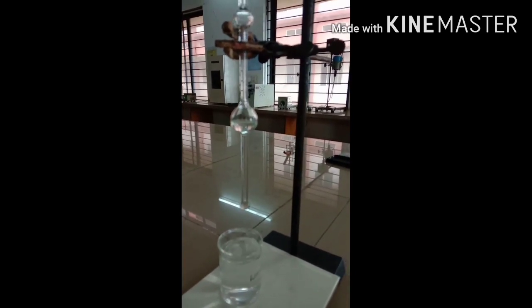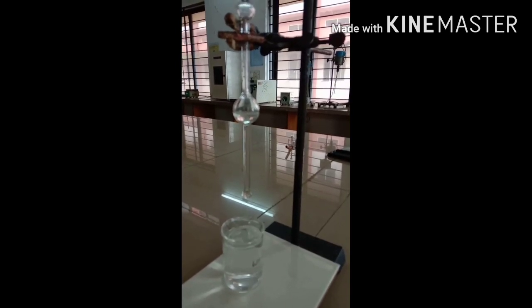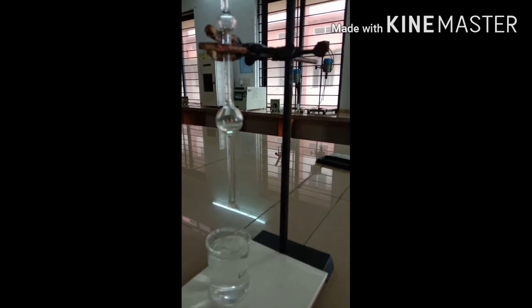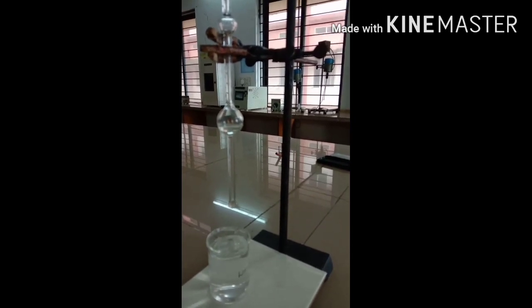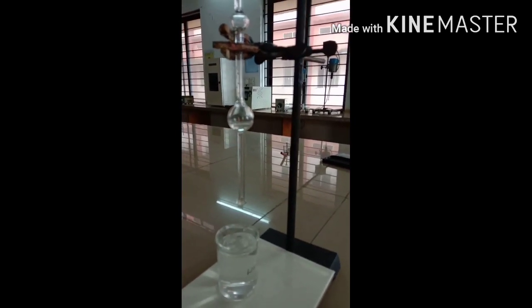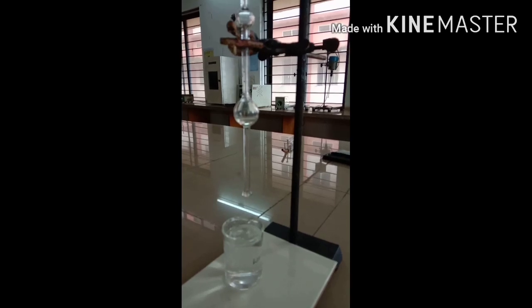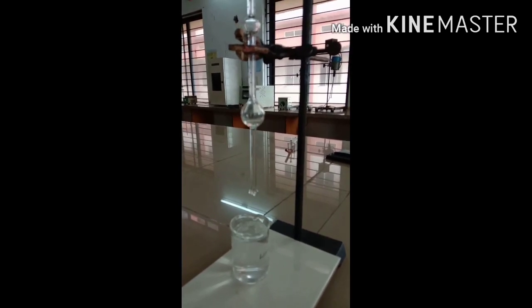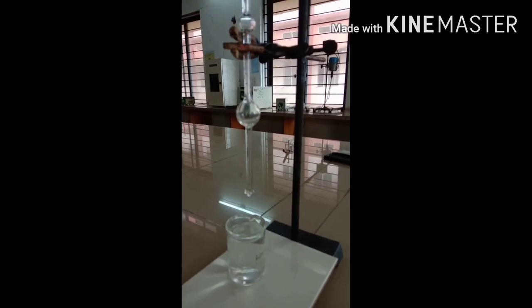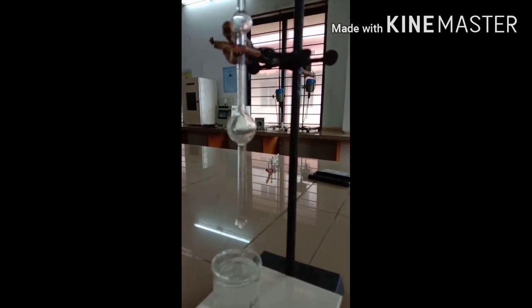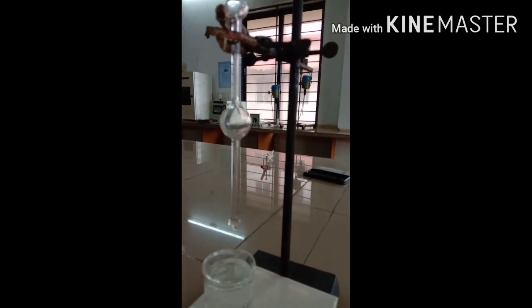Go on counting the drops. Here water is used as a reference liquid for which we know the surface tension. Count the drops till it comes to the lower mark. Repeat once again till you get a concordant value. You have to get the same number of drops.